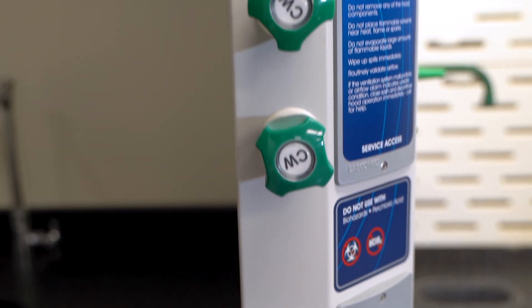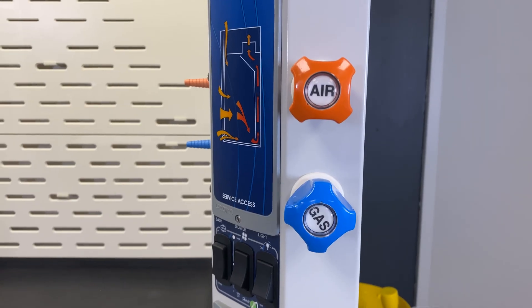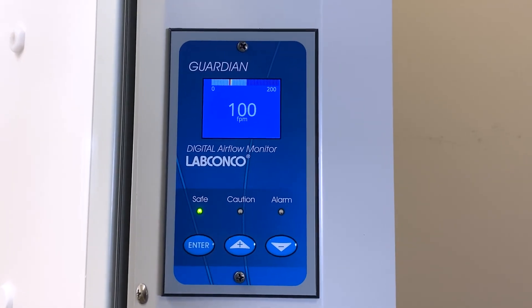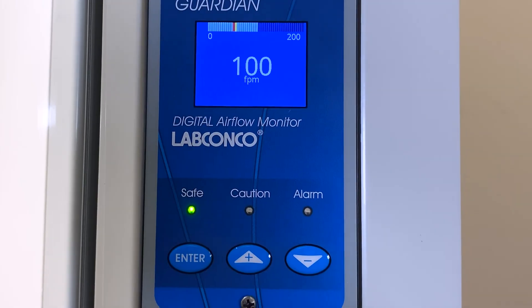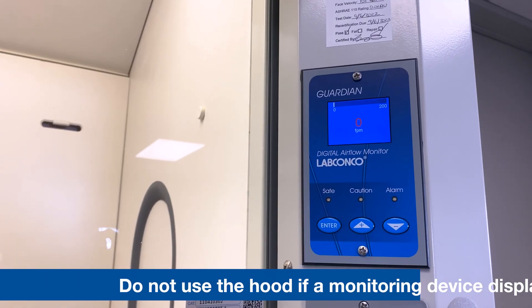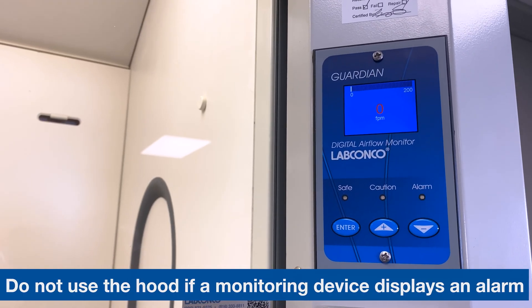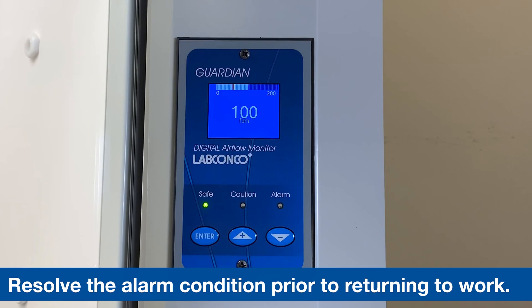Fume hoods often have services available on the front of the hood. This can include water, air, gas, and electrical fixtures. Each fume hood is required to have an airflow measuring device to validate safe operating conditions. Do not use the fume hood if a monitoring device is not present or is displaying an alarm condition. Resolve the alarm condition prior to returning to work within the hood.